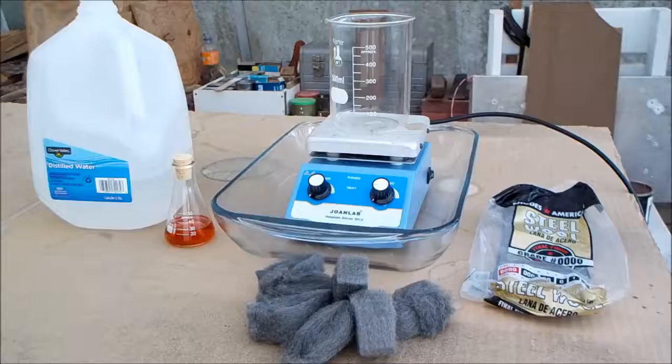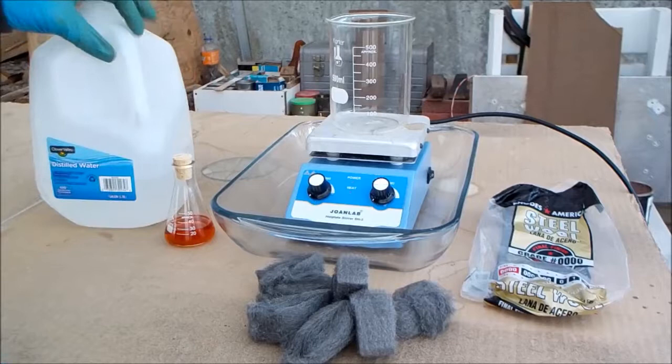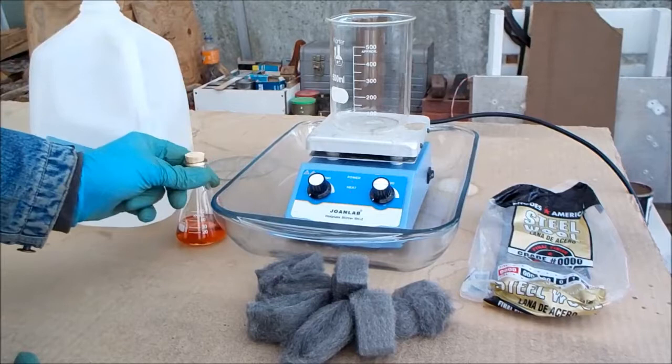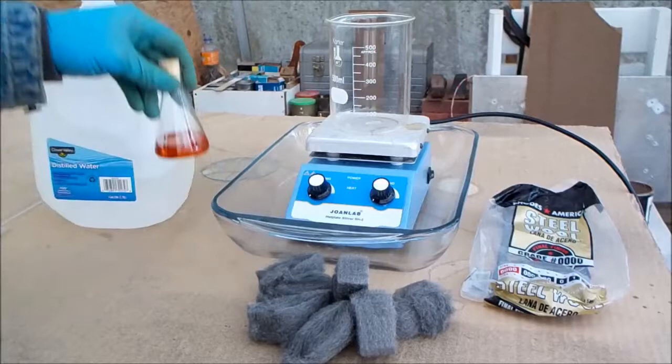In the first part of this video, I'm going to be making some iron(II) sulfate. To do that, I'm going to need three things. First is just some distilled water. The second thing we're going to need is some sulfuric acid. This is drain cleaner acid, about 25 milliliters, or by weight, 43.6 grams, and this is the amount determined by stoichiometry with about a 5% excess of acid.